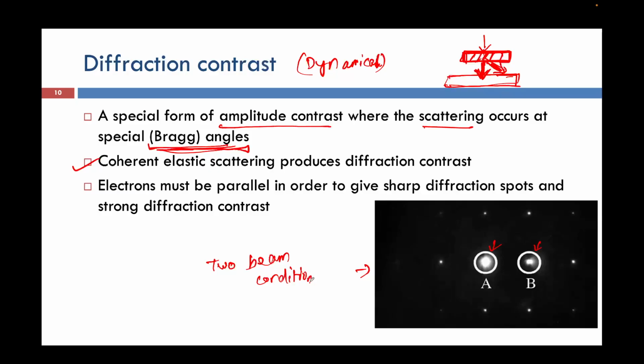when we talk about diffraction, we generally perceive that my electron beam is coming and getting diffracted from one type of plane. Let's say it has diffracted from H1, K1 and L1, right? We never consider that the same diffracted beam, after diffracting from H1, K1 and L1, can again diffract with the same Bragg's condition from H2, K2 and L2.